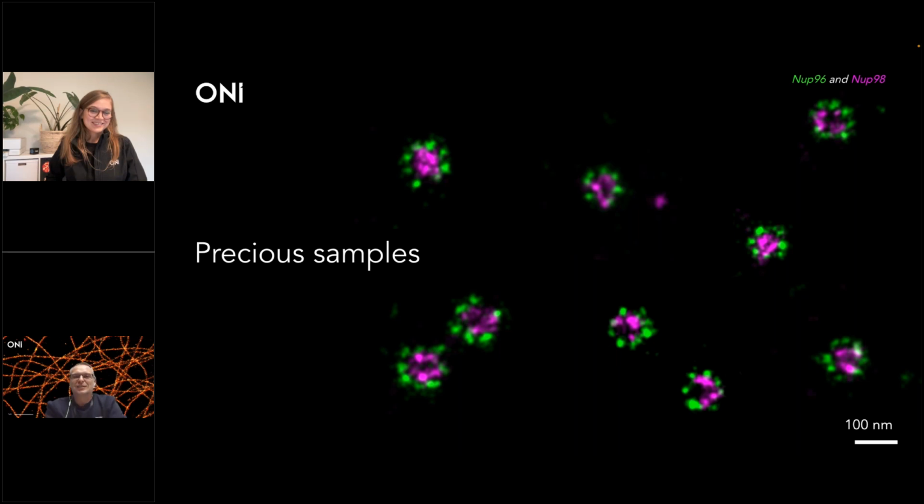Wow, hearing it for the first time, but we did some fibers. What I would suggest is that if you can grow your cells directly in dishes which already have a glass cover slip on the bottom, that will be a big benefit. Because if you need to manipulate your cells afterwards and move them to cover slips, you can actually break this. So I would recommend directly seeding and growing your cells on the dishes that you will use for imaging.